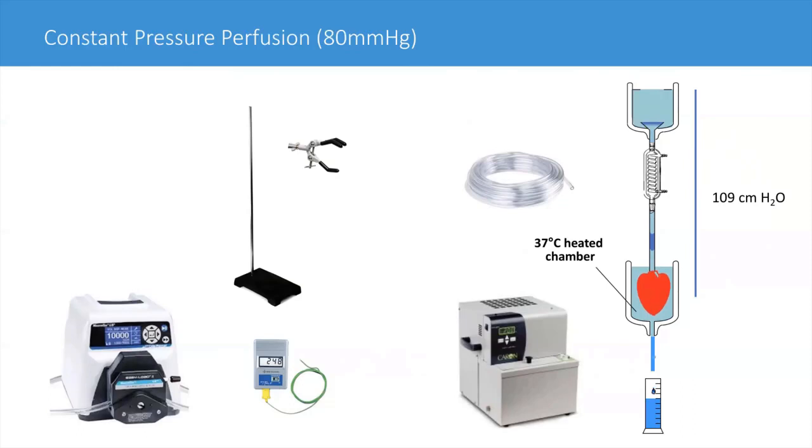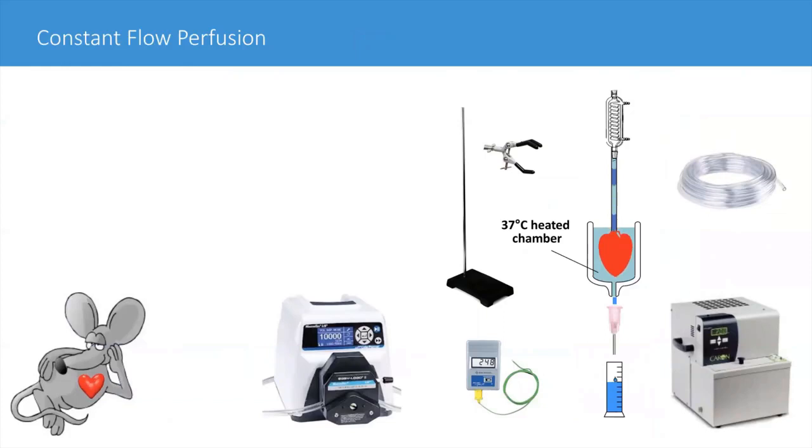For constant flow perfusion, this is a bit simpler, as the desired flow can be achieved by just regulating the flow rate of the pump.